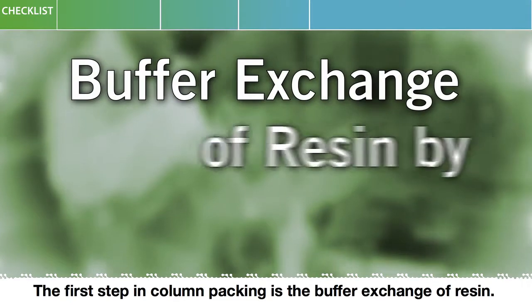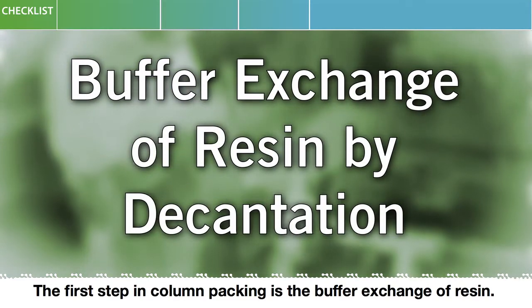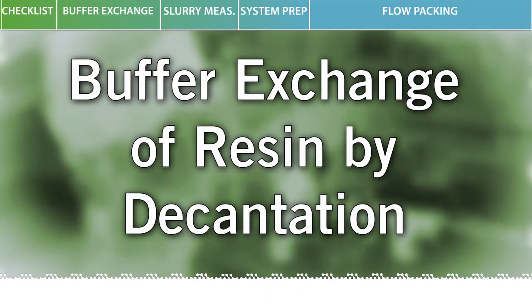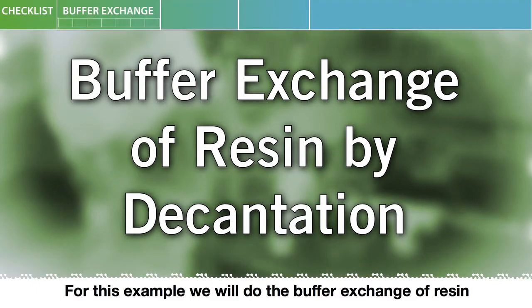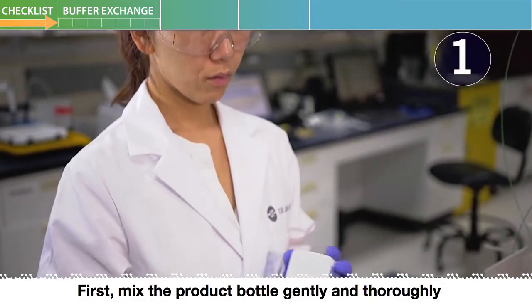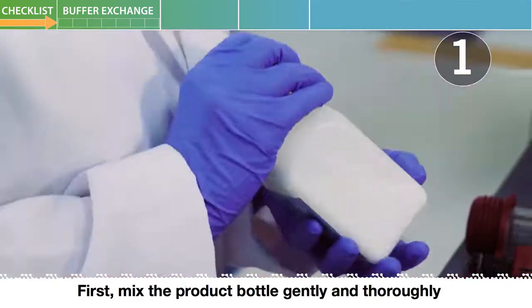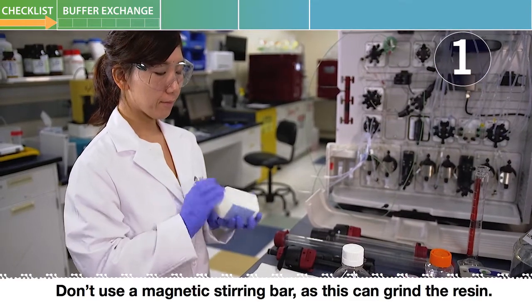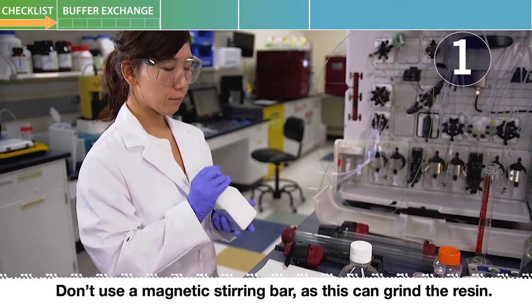The first step in column packing is the buffer exchange of resin. You can follow along with the navigation bar at the top of your screen. For this example, we will do the buffer exchange of resin by decantation. First, mix the product bottle gently and thoroughly to disperse the resin. Don't use a magnetic stirring bar as this can grind the resin.